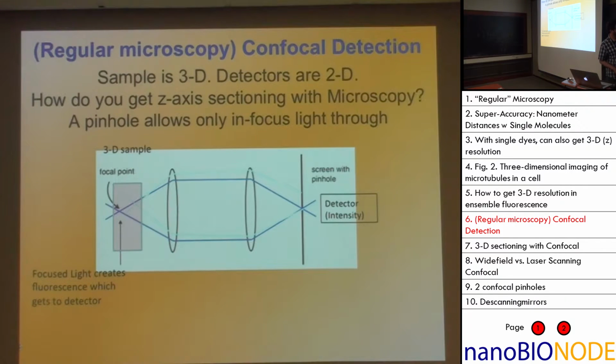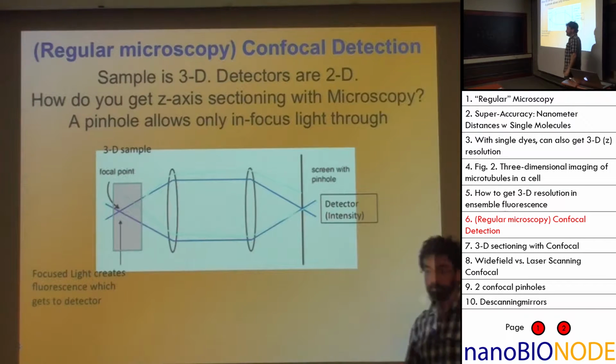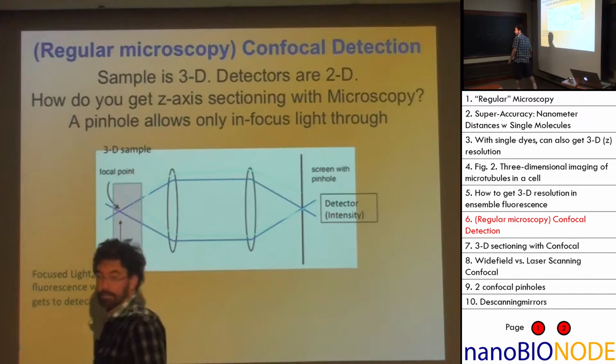And let's say we had our pinhole such that over here we want that to get through and nothing else. The pinhole here will get this, and this will be all over here. In general, it will not be at that particular point.